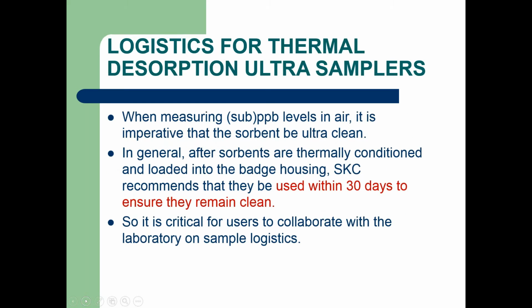Now let's review sample logistics when using samplers designed for thermal desorption. In general, US EPA and SKC recommend that sorbent samplers be used within 30 days after thermal conditioning. This will ensure that the sorbent stays ultra clean for PPB level VOC measurements. Now, I'm sure this 30-day time frame no doubt seems unusual to hygienists. For standard IH sampling of VOCs, sorbent media can be kept for years on the shelf. But this is not the case when you're looking at PPB level sampling with thermal desorption analysis. So it is really critical for users to collaborate with your lab.